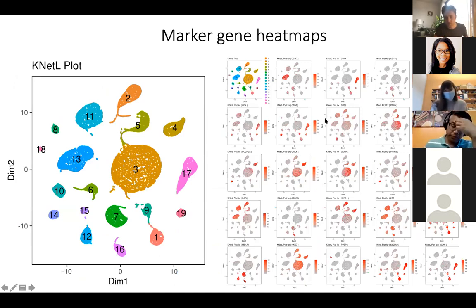Again, you can turn on some markers in here. I want to look at some of them. So you turn on CD3E again. These top parts are all CD3E positive T cells. And then CCR7, that would be your memory T cells, because if you turn on CD8, these are CD8 positive, and these are CD8 negative. If you turn on CD68, you see the myeloid cells in here.